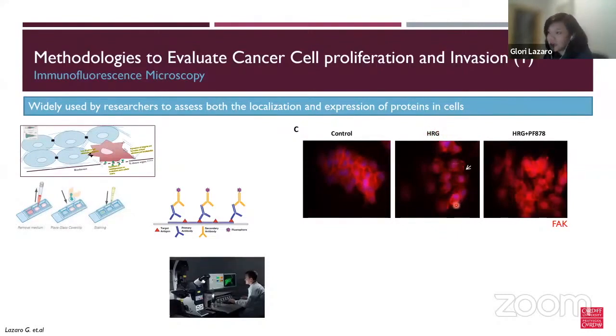And you can see, I'm sure even if you don't know much about cancer cell migration, it's very obvious naman that cells start to separate from each other. And they start forming these focal adhesions, yung mga paa at mga kamay, and they start moving away from each other. And then I was working on this drug, PF878 from Pfizer at the time.